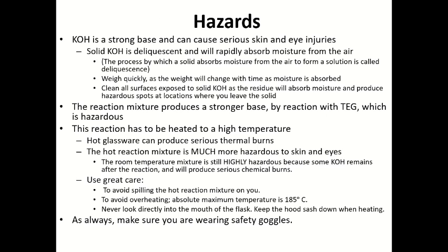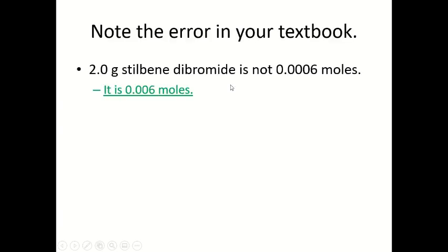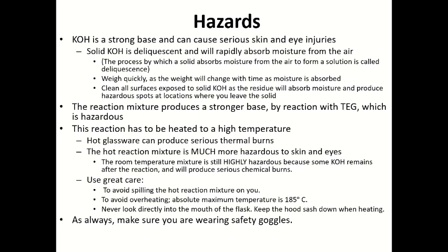the opposite example would be efflorescence, right? So then you have to weigh quickly, as the weight will change with time as moisture is being absorbed, right? Then you have to clean all the surfaces exposed to solid potassium hydroxide, as the residue will absorb moisture and produce hazardous spots in the location where you leave the solid.